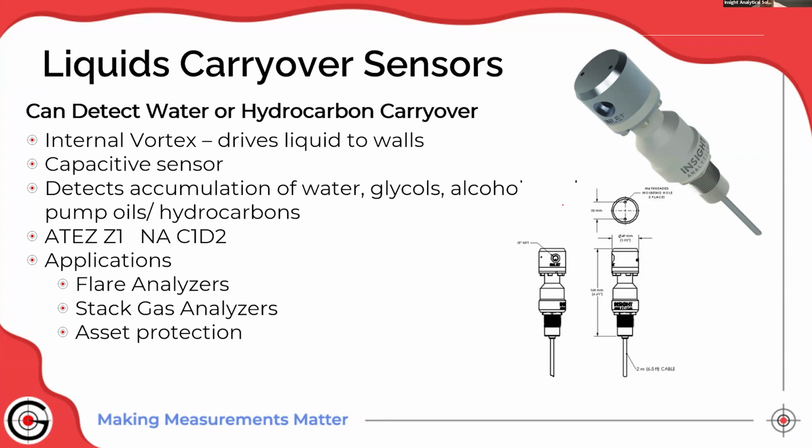So these devices are put in line. So we have a piece of tubing, flows through the head of that device. So there's an entrance port and an exit port. Inside that device, it's been machined so that it runs kind of like a swirl filter. It makes the fluid run round and round the wall as it goes down. So the fluid comes in and starts to go into a cyclone and goes down into a little cup, basically.